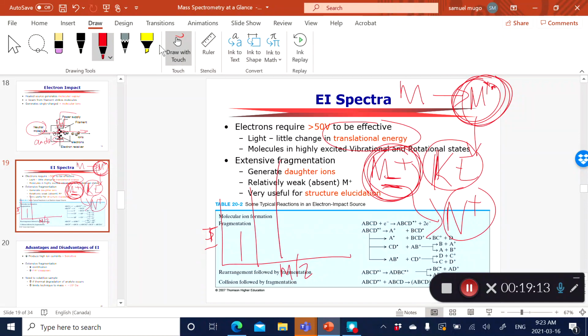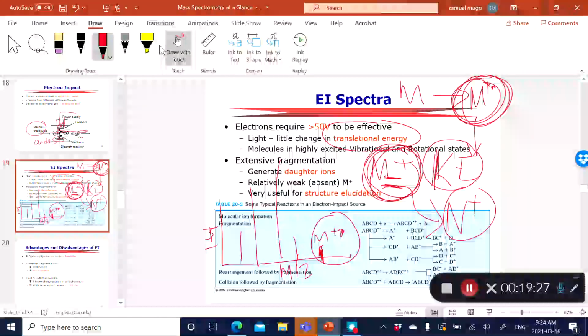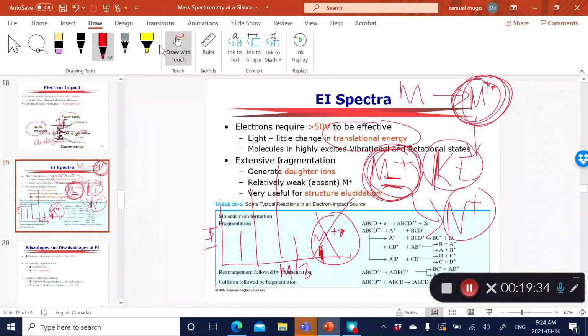And then, of course, you would have the different types of fragments. And typically the molecular ion, of course, if it exists at all, is going to be the highest molecular weight, mass-to-charge ion. But again, depending on the type of molecules you're analyzing, sometimes you never actually get to see the molecular ion because it tends to fragment completely.